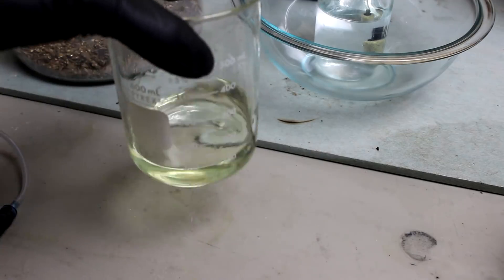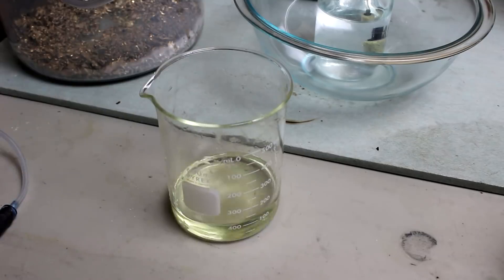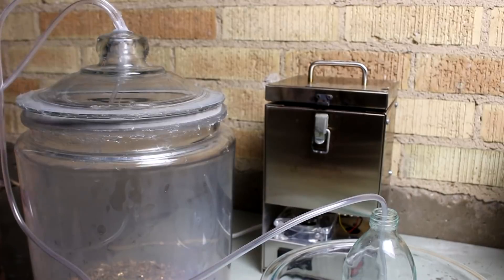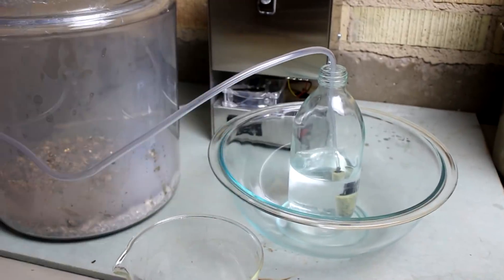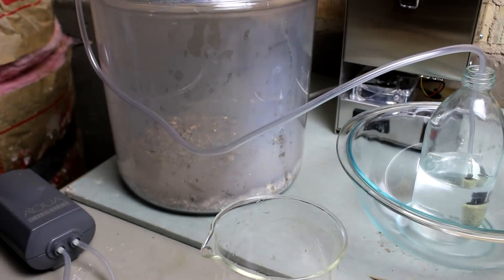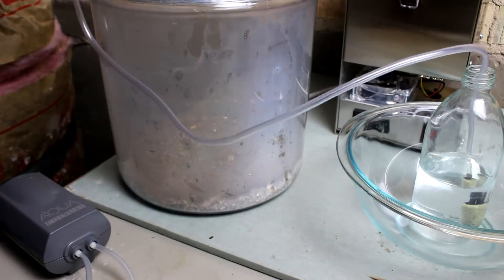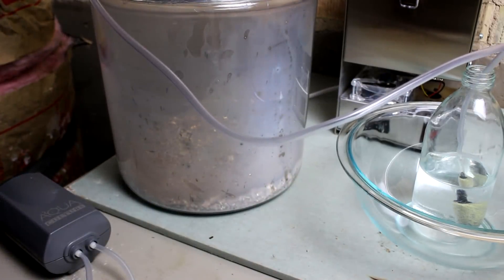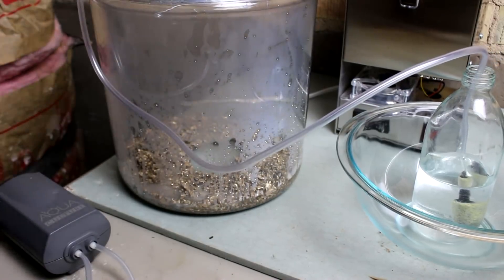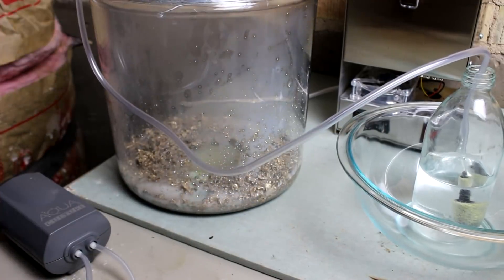I need to dissolve the silver using nitric acid. I've got about a hundred milliliters here; I'll probably need quite a bit more than that. I've got this jar with a tube coming off the top going down into some hydrogen peroxide — it'll make more acid over here. I'll turn my little pump on to get some air into the chamber. Now let's add the acid a little bit at a time, just so I don't use more than I have to.